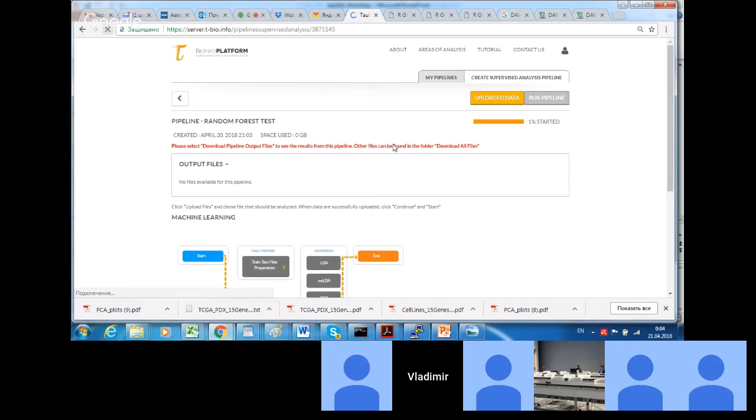This processing standardly includes preprocessing that can be avoided without an essential effect, but still adaptive trimming is desirable, expression level quantification, and in many cases differential analysis can be performed. All this can be performed using a simple mouse interface in the server.t-bio.info platform.